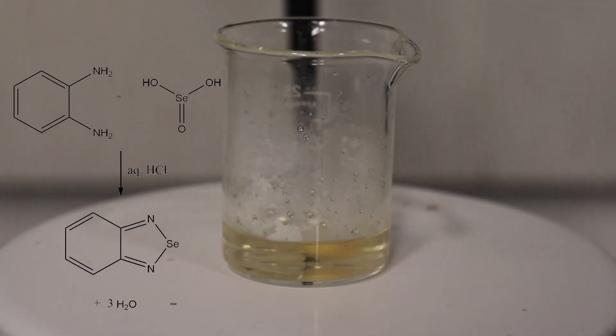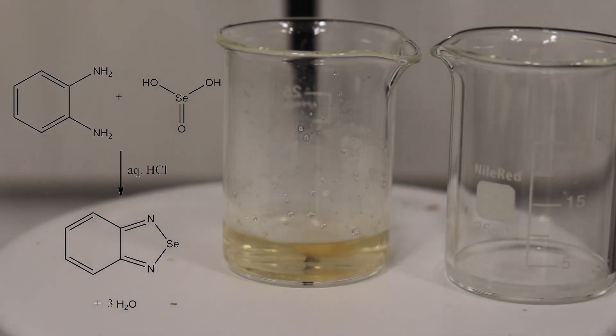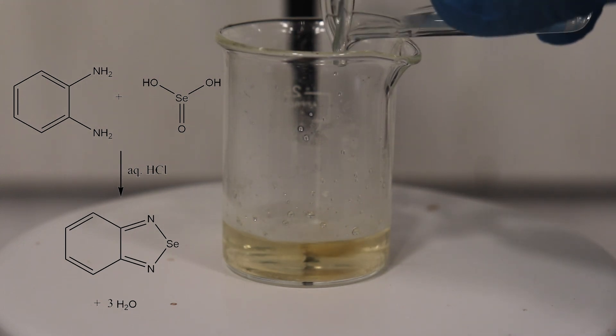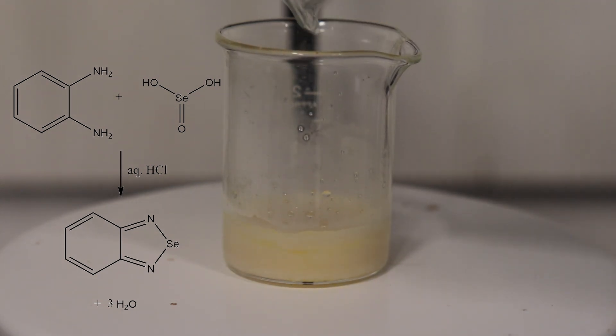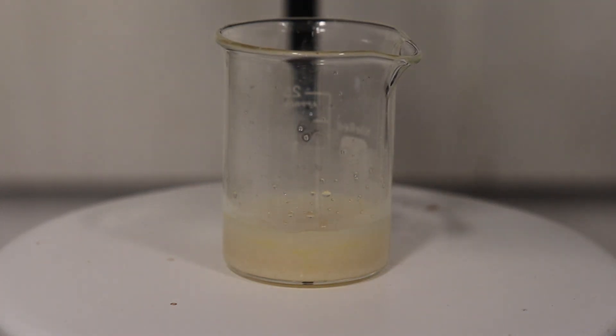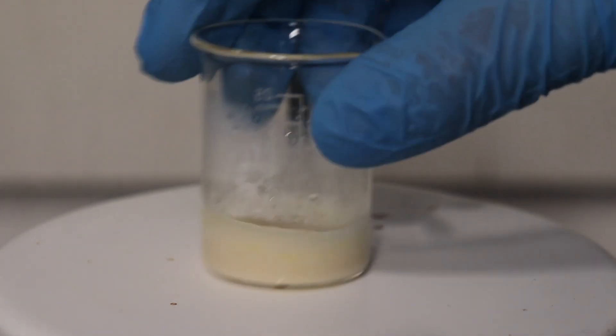For our reaction, the selenus acid solution is poured into the orthophenylenediamine dihydrochloride solution, followed by the immediate precipitation of our product. You can then immediately filter this precipitate, or wait an additional 2 hours to maximize yield, but I just went on and filtered immediately.